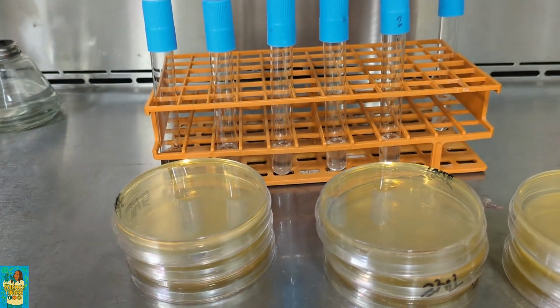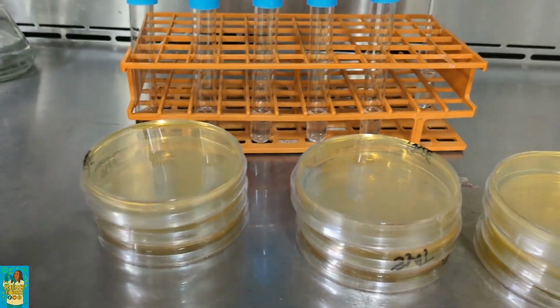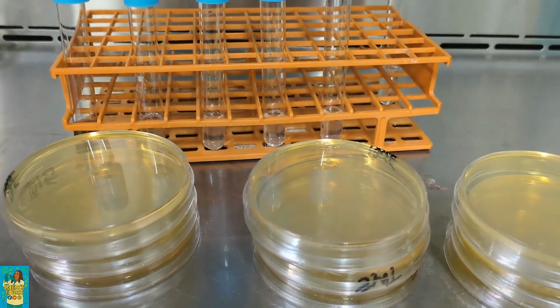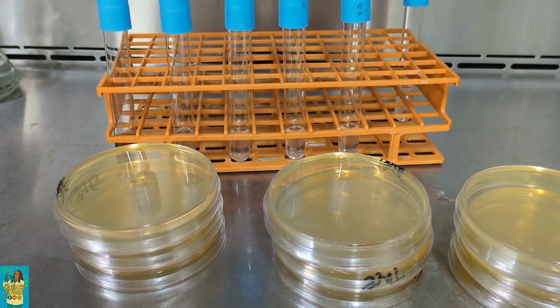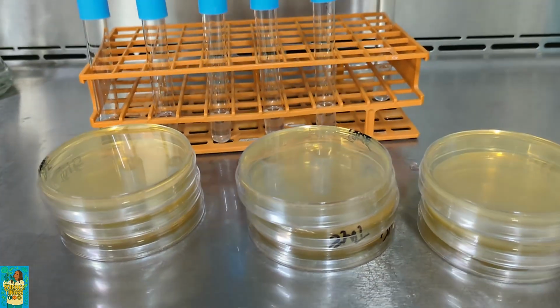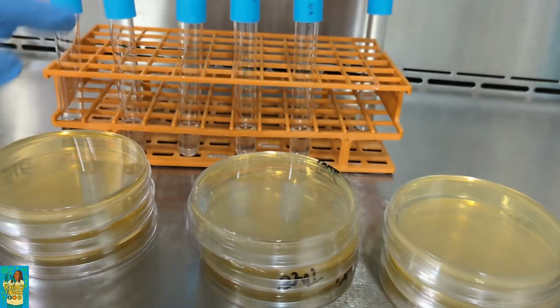So I have antibiotic which will prevent bacteria from growing because there's bacteria everywhere in the soil too. And then there's also fungus. So I put different chemicals in it that will reduce or slow the growth of other fungus or fungi, plural, while allowing my specific one to outcompete the other ones. So I am just going to go ahead and mix each of these.